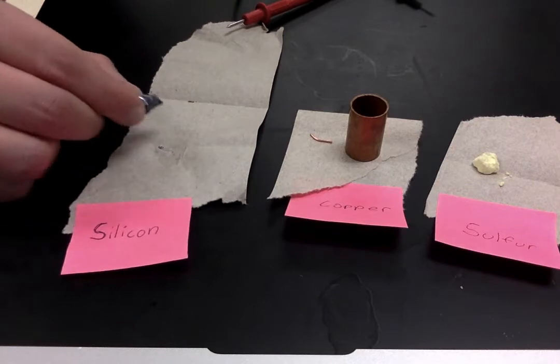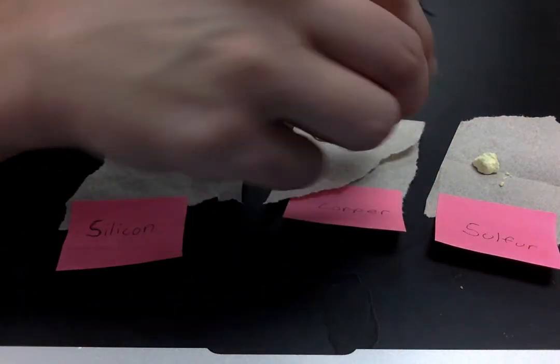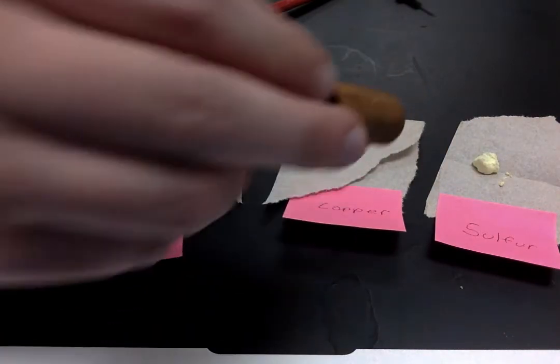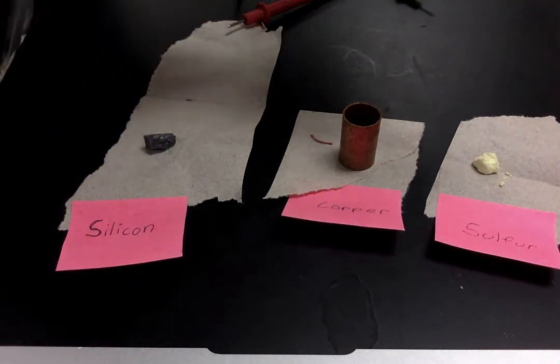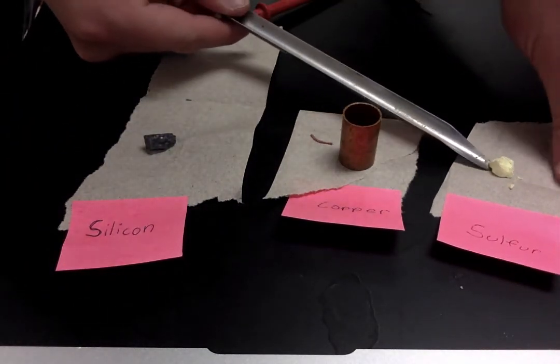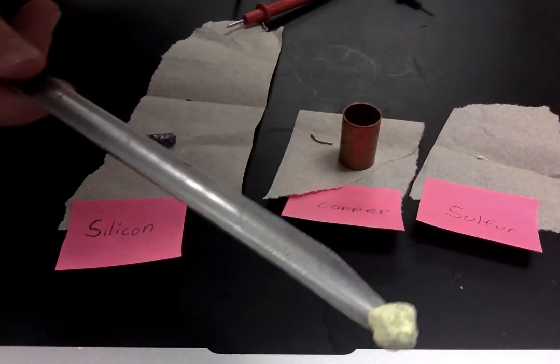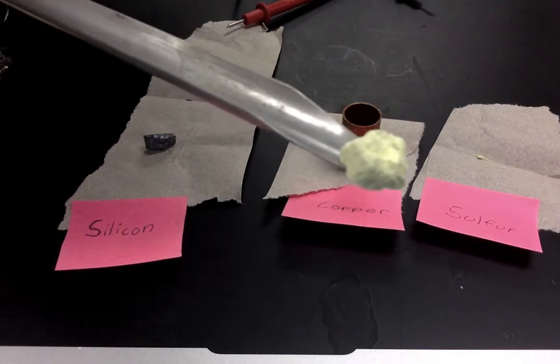And so maybe you need a little bit closer look. So that's silicon. Whoa, that's copper. And then for sulfur, I need to use what's known as a spatula because I don't want to touch that with my bare hands. Here we go, sulfur. Hopefully you can see that.